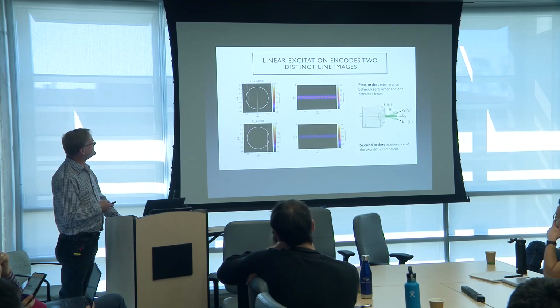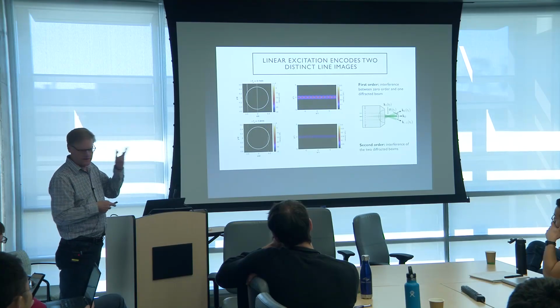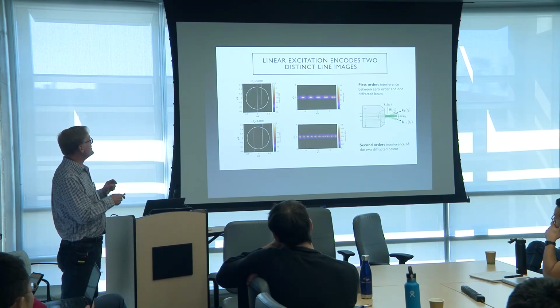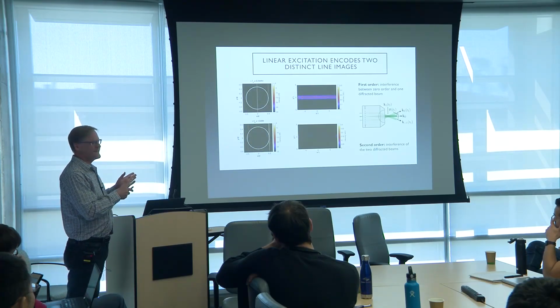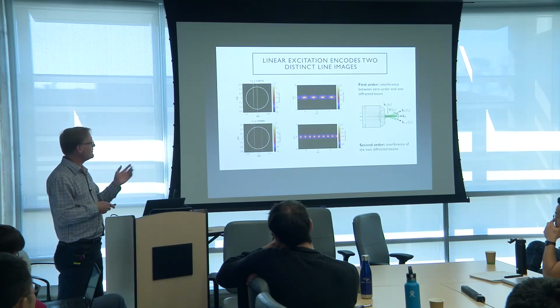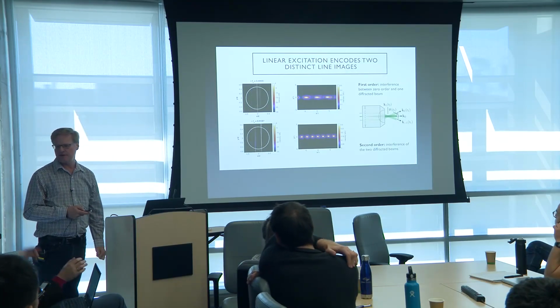So we really get these two, and this just shows that if I look, there's the interference between that marginal ray and the central ray, and it's always lower spatial frequency content. With these two, it's always much higher. And if you look, the rate that this 0th order is separating from the center is much lower than the rate at which these two are walking off from one another. So they're at twice the frequency, and it automatically encodes this image. I mean, this never happens, right? You get it for free at a carrier frequency that's easily separated and detected.